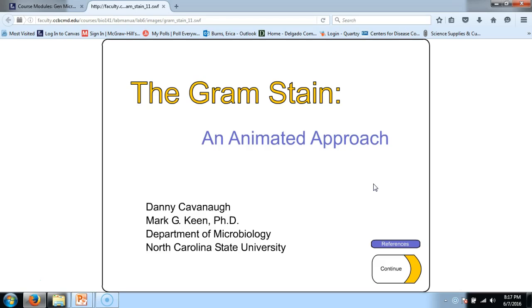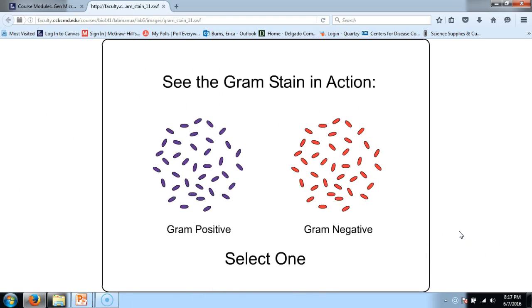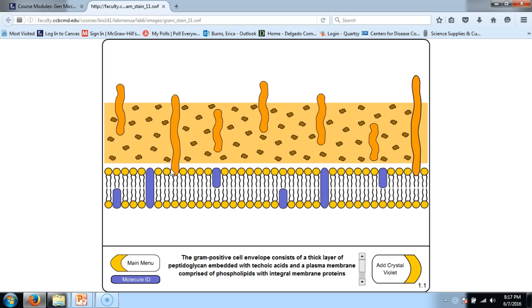As I said, do we have one barrier or do we have two? This tells us. So let's start with the one guy, and that would be our gram-positive. And again, positive and negative doesn't mean charge or anything like that. This is basically a test you're running. Does it stay purple? Okay, it's positive. Does it not stay purple and therefore pink? It's negative for the gram stain test. Okay? So let's start with our positives.